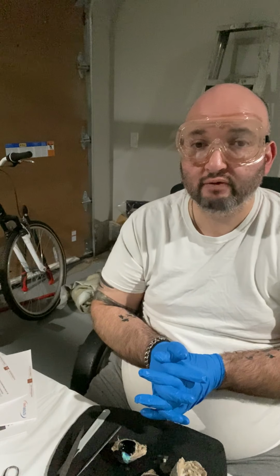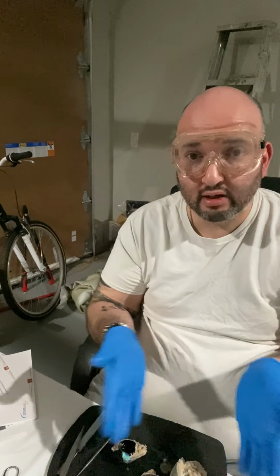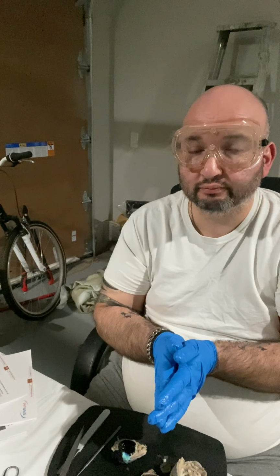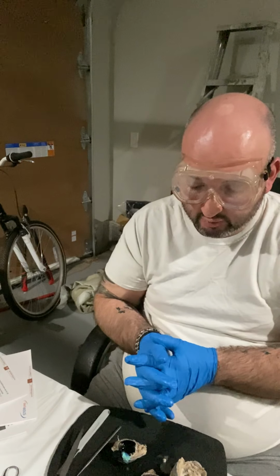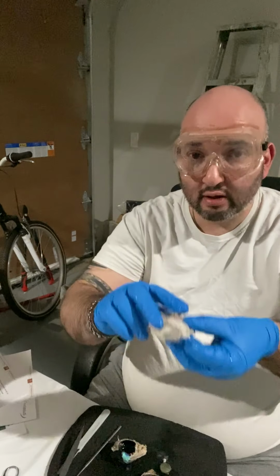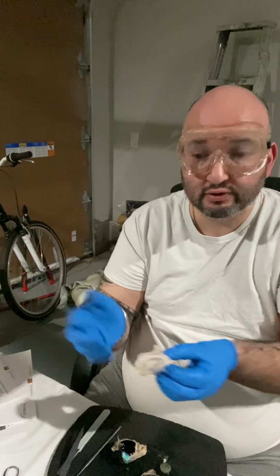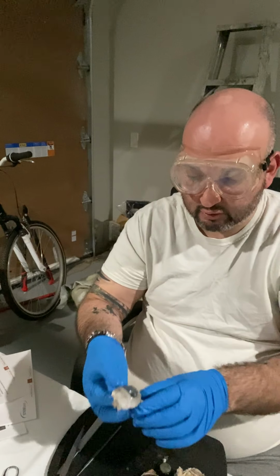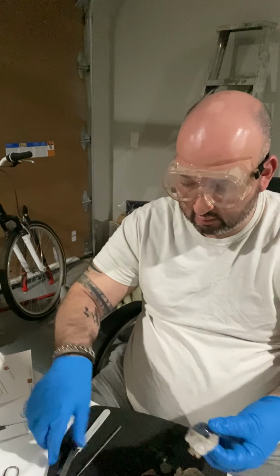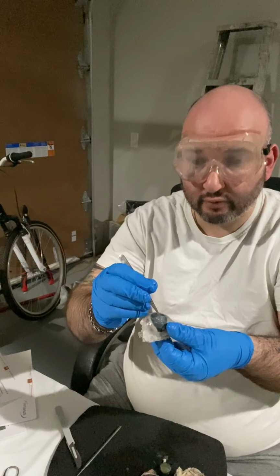So again, this video was for week 8 of Biology 230, anatomy of a cow's eyeball. I've talked about the optic nerve, which is the nerve that sends impulses to the brain. The cornea, which is the transparent layer, is just right here.